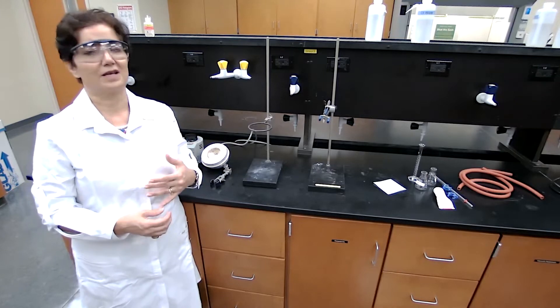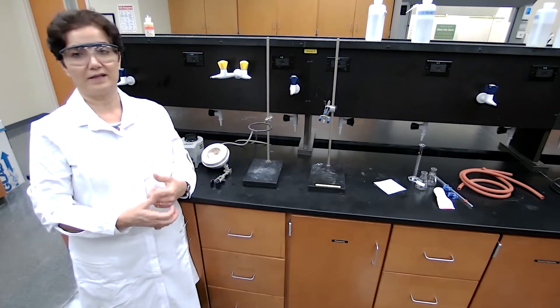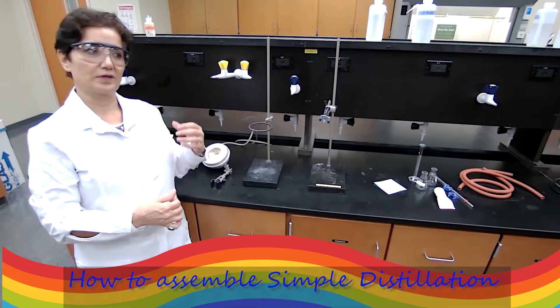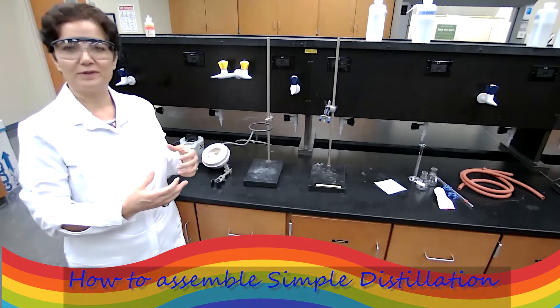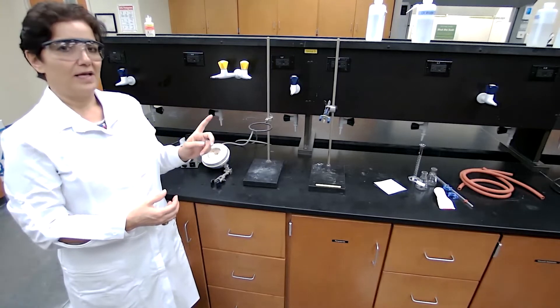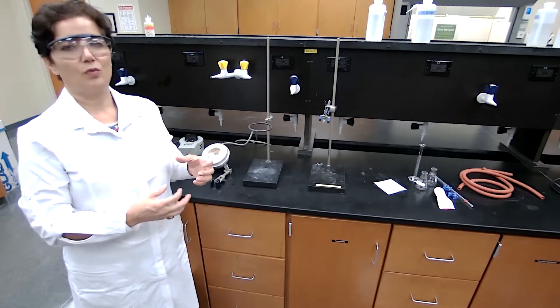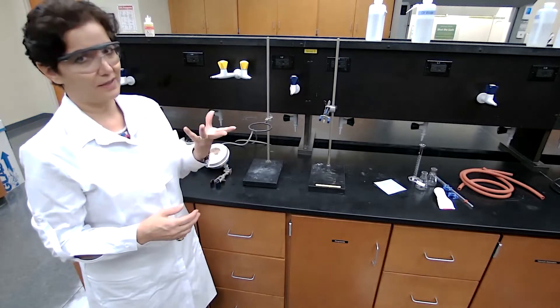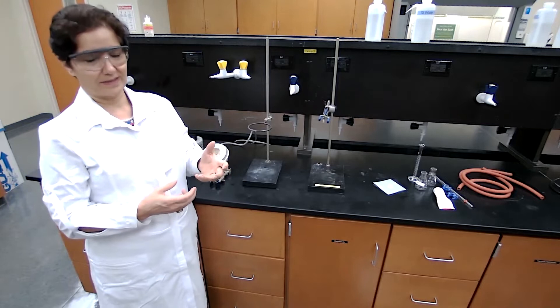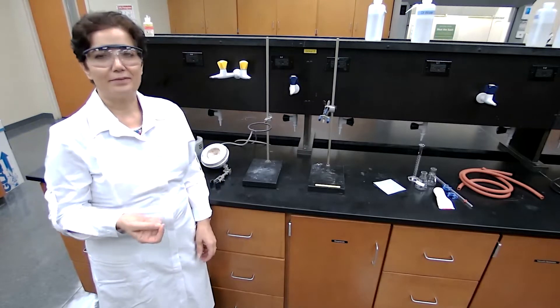This experiment is like vacuum distillation and steam distillation. For now, we are going to concentrate on the two that I talked about: simple and fractional distillation. The purpose of today's experiment is to learn how to assemble distillation apparatus, and then we are going to perform two experiments, one for simple distillation in order to calibrate our thermometer. Because the chemicals I'm using in simple distillation, one is solid and the other which has very high boiling point, and the other one is a volatile compound. So I know that only one compound is going to vapor and condense, and I can measure the boiling point. I'm using the simple distillation to calibrate the thermometer.